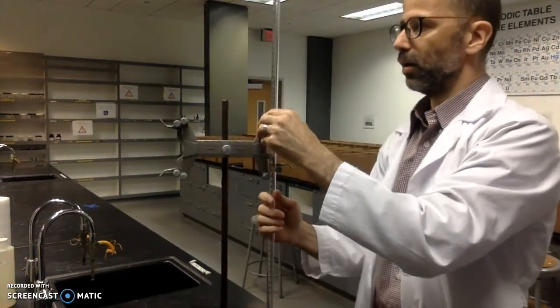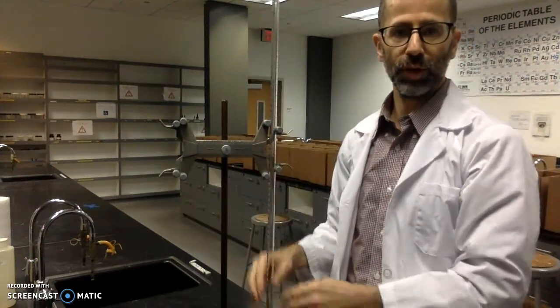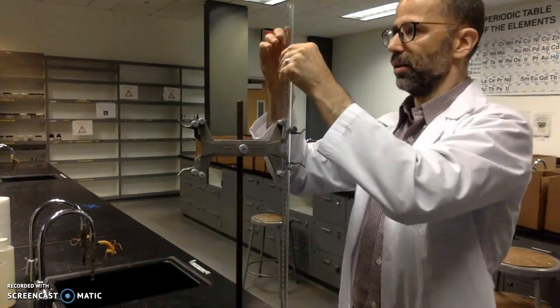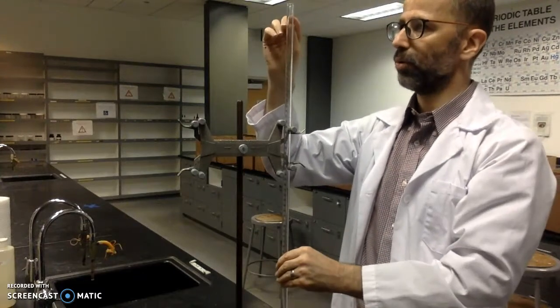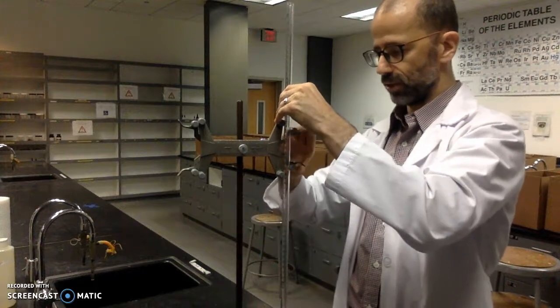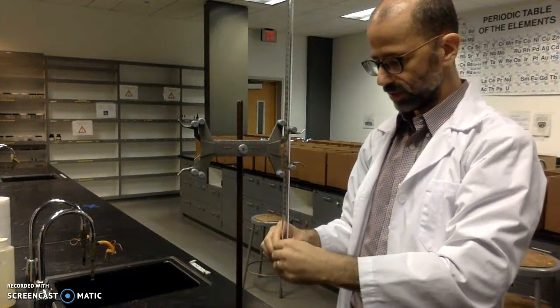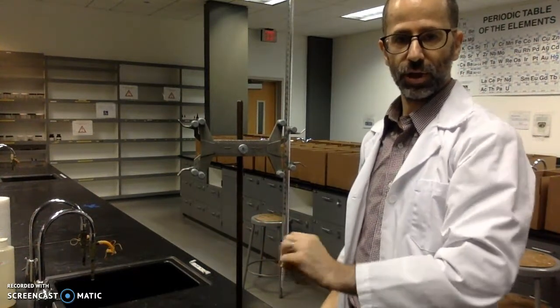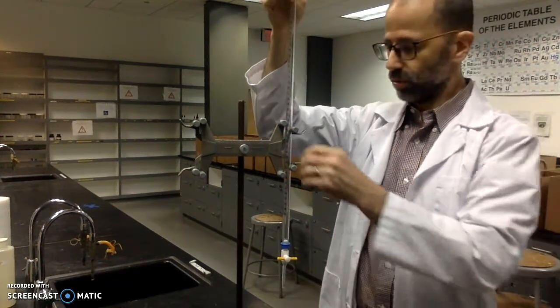One of the things you want to be aware of is after you've primed this, you want to fill it up with your substance, and you want to fill it up past the line. The reason why is because you need to drain it through your stopcock. So if I raise this up here, you'll drain it through the stopcock to get out the air bubbles. Like I showed before, you're going to turn it 3 times.